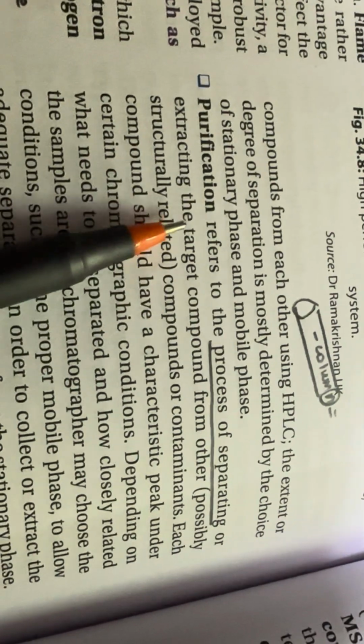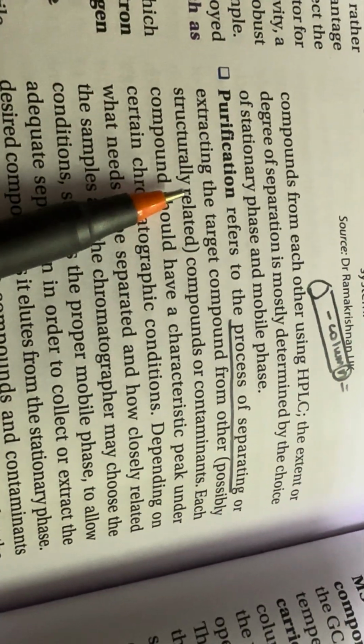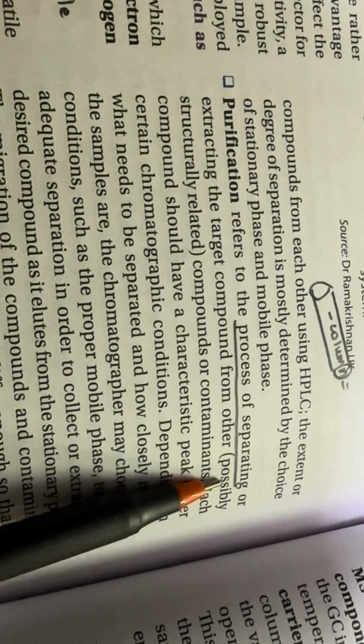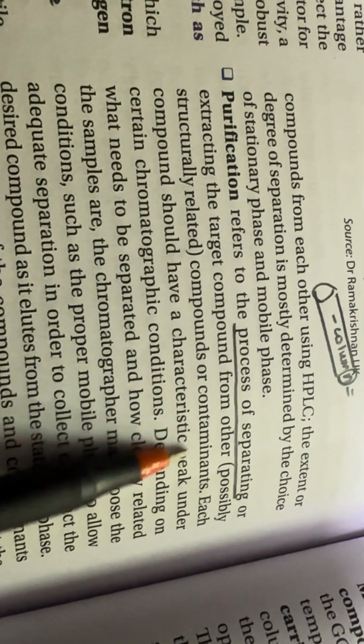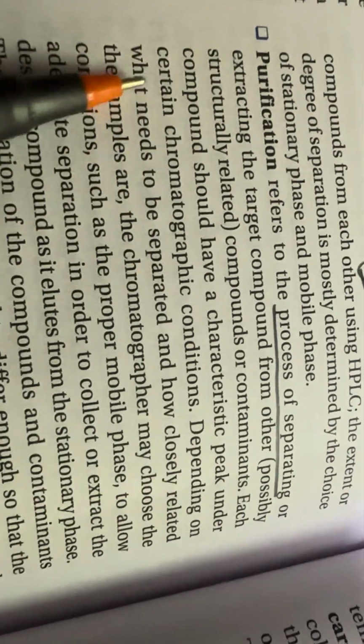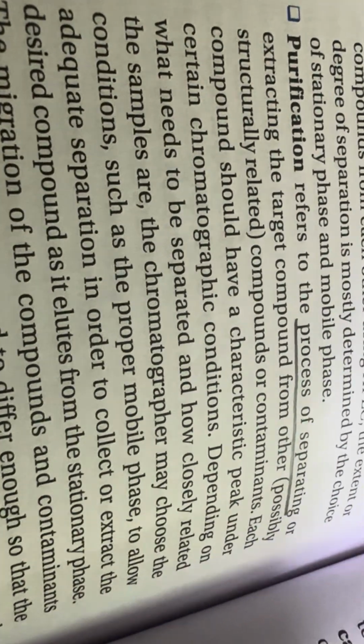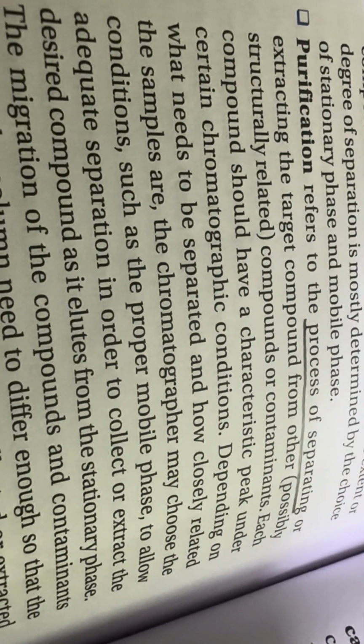Next is purification. Purification refers to the process of separating or extracting the target compound from other, possibly structurally related, compounds or contaminants. Each compound should have a characteristic peak under certain chromatographic conditions, depending upon what needs to be separated and how closely related the samples are.